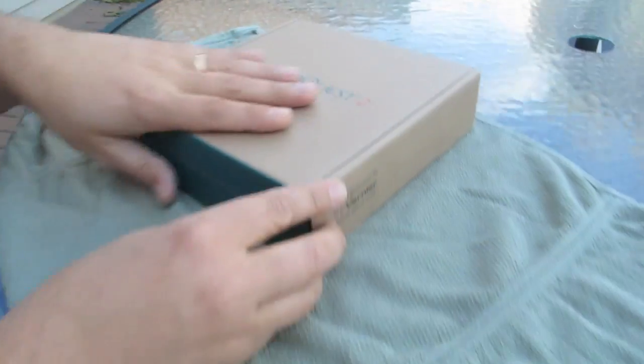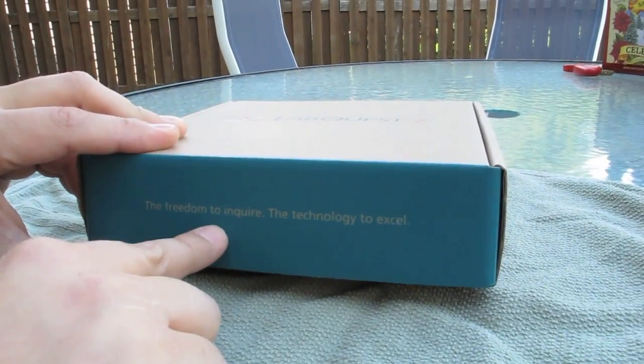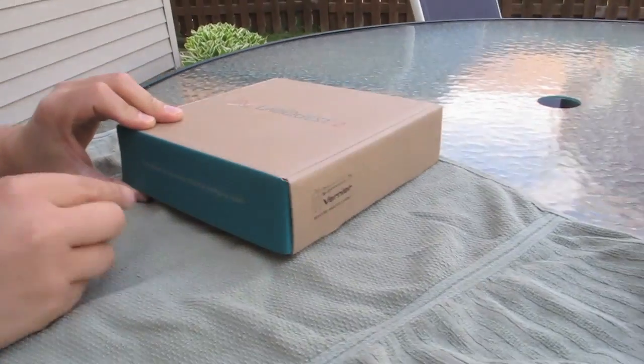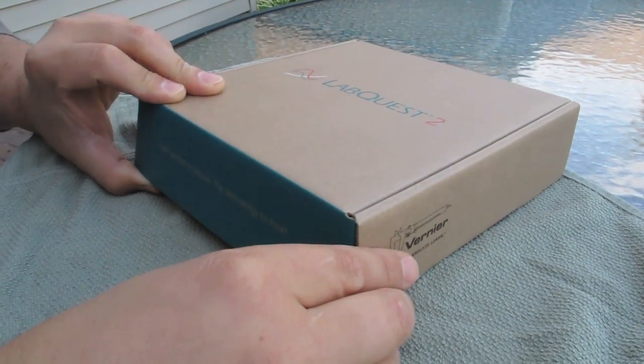So far, eco-friendly packaging. And look at this when you flip it open: 'The freedom to inquire. The technology to excel.' It just oozes — this is National Poetry Month. Right here, poetry in motion.